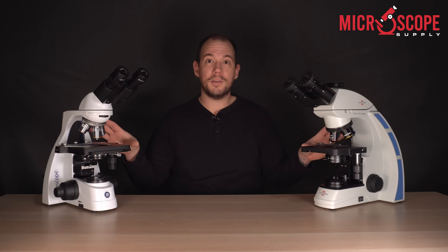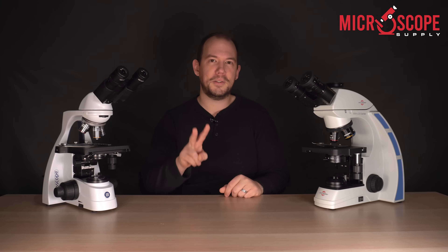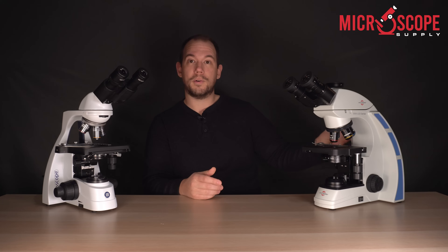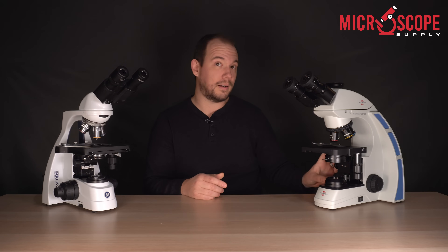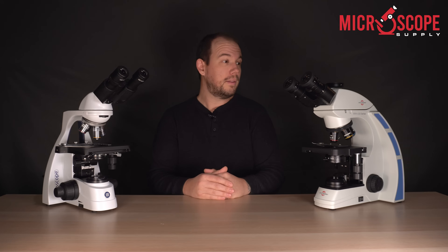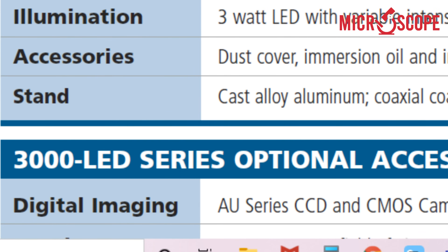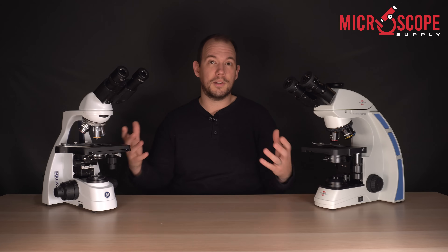The number four thing to consider when purchasing a compound microscope are the materials the microscope is made of. We'll put materials into two categories: the body or frame of the microscope, and the gears for the fine and coarse focus. Starting with the body — some microscopes, like both of these, feature cast aluminum frames, meaning they are extremely durable and can withstand a lot of abuse and misuse. If you can't find that information in the manufacturer's description, it may mean that a lot of plastic is used in the construction of the frame.